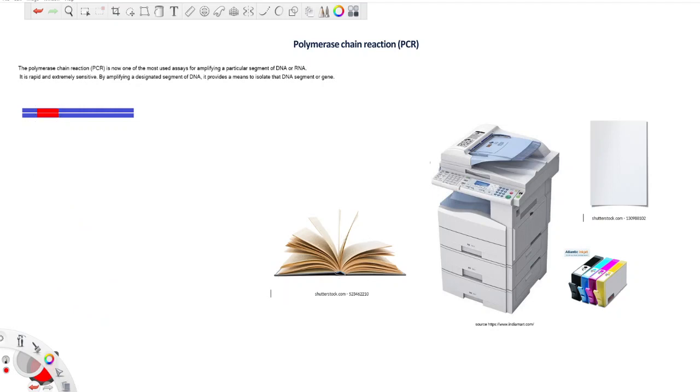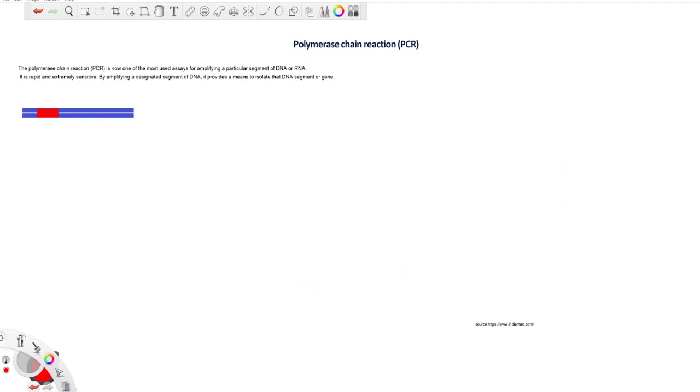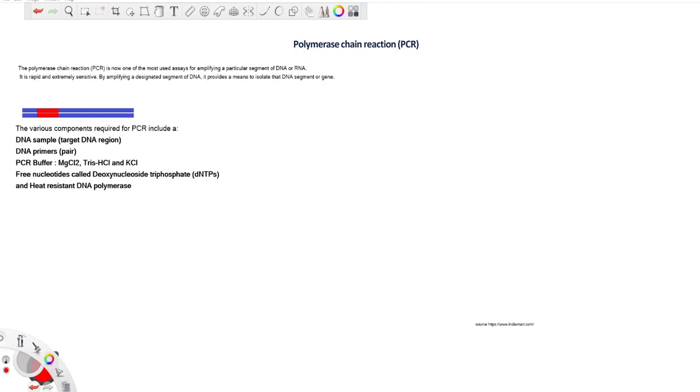But of course, what we are after here is not necessarily this simpler illustration. It won't be enough for us to get it, but at least it will lay a nice foundation as we dive deep into this PCR definition or work. Now, various components are required for us to run a successful PCR, as we mentioned earlier, just like when it comes to making a photocopy.